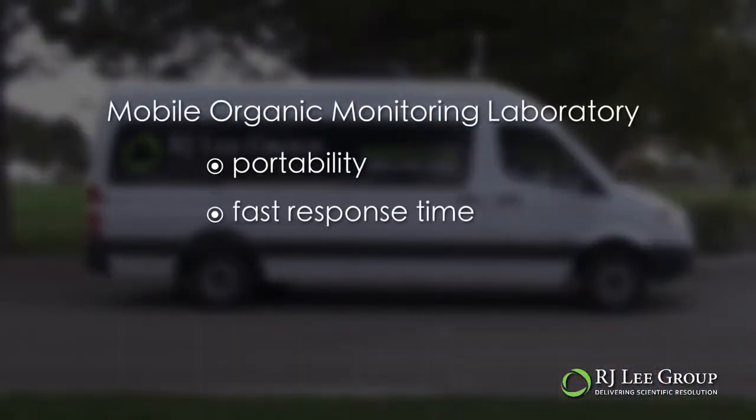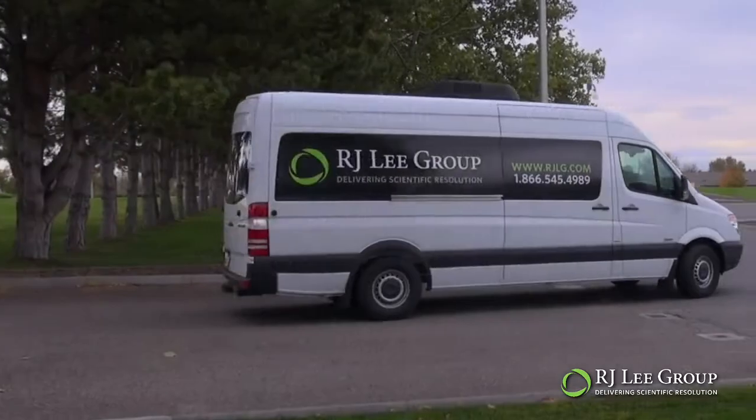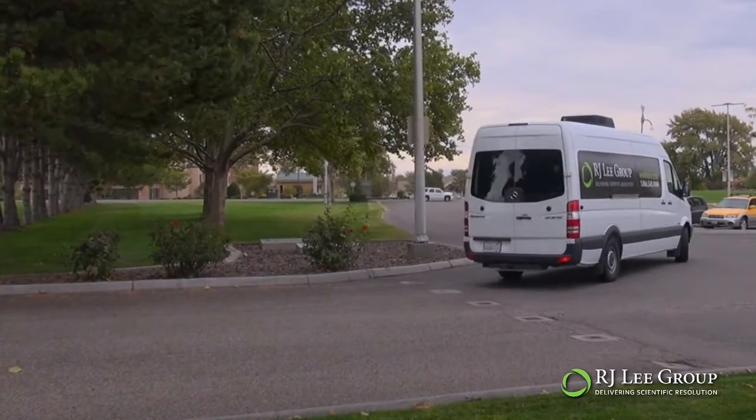Portability, fast response time, and low operating cost make the Mobile Organic Monitoring Laboratory an ideal air monitoring solution.